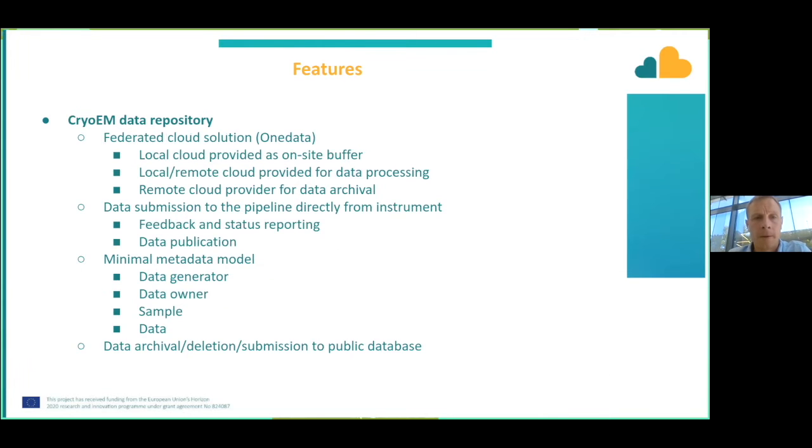and the status of the data transfer in real time. So the whole system is federated, is based on the federated cloud solution, and we're currently using OneData for that. We have a local cloud provider on site in the facility.